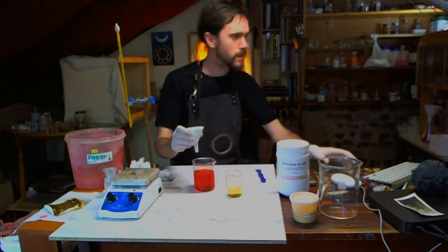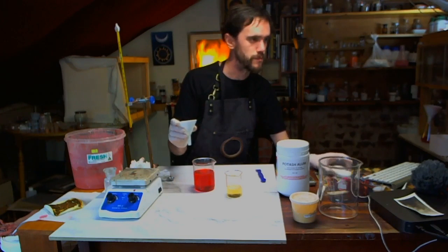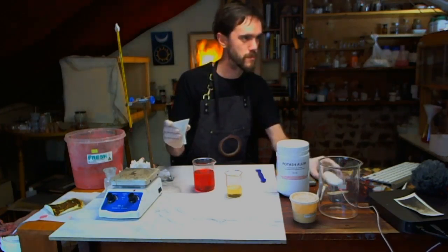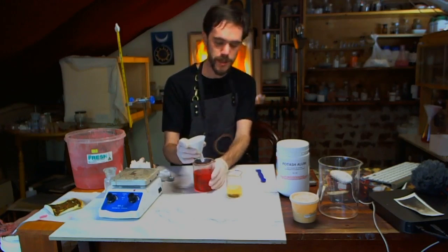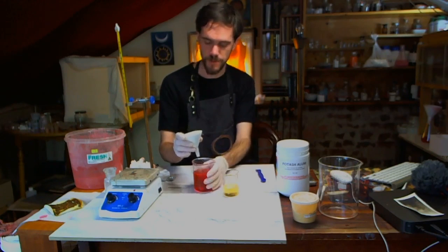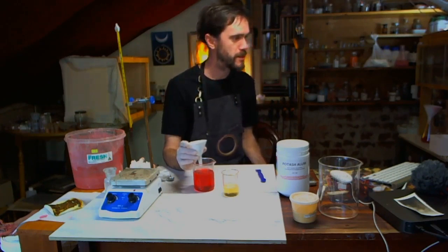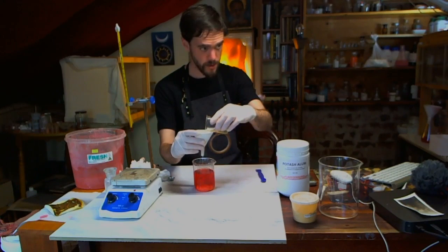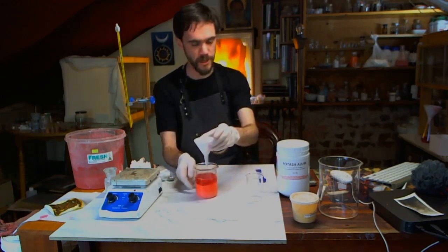Alright, so let's just go back to the book. So it says here, we combine the lead acetate in here at a temperature of 50 degrees, and the mixture is agitated intensively until all the sulfate is turned into lead sulfate. The deep red liquor is then removed from the lead sulfate. Okay, cool. Alright, so let's go. There you go. You can see immediately we have lead sulfate forming at the bottom there.